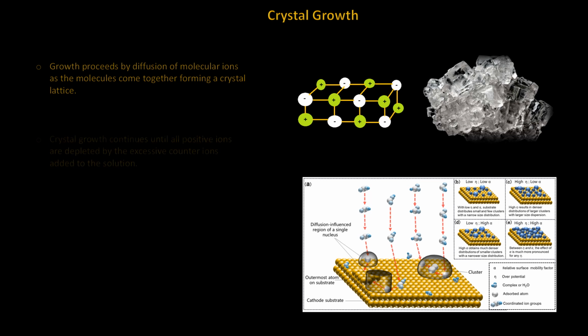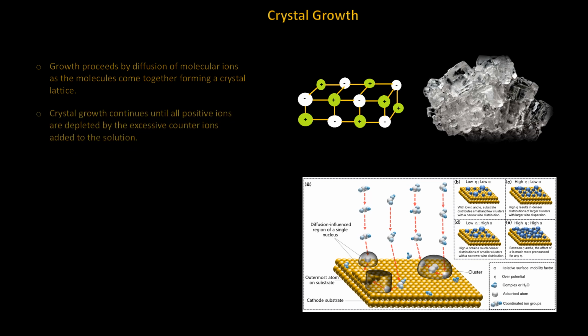The crystal growth will continue until all the positive ions are depleted by the excess number of counter-ions that are capable of being diffused into the crystal lattice. A minute number will not fuse due to the process of equilibrium, which will be discussed later in the series.